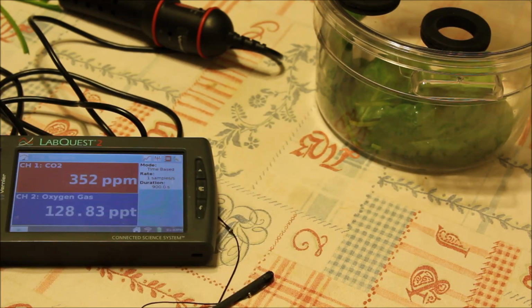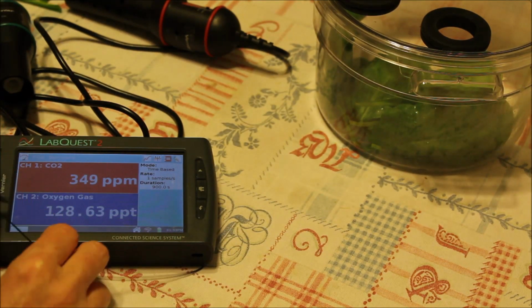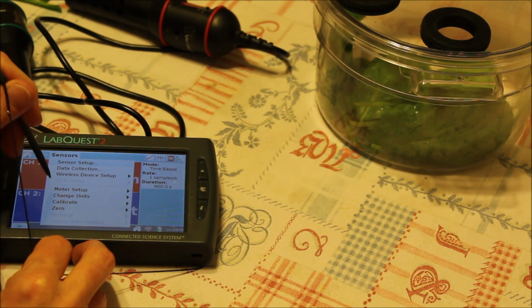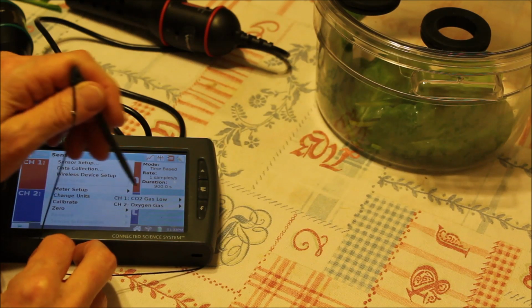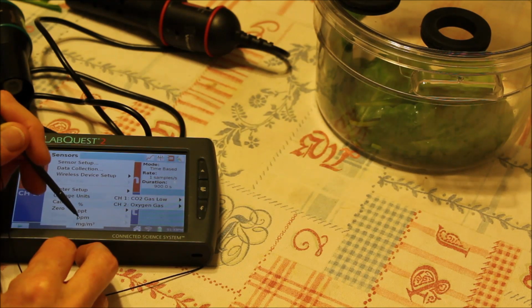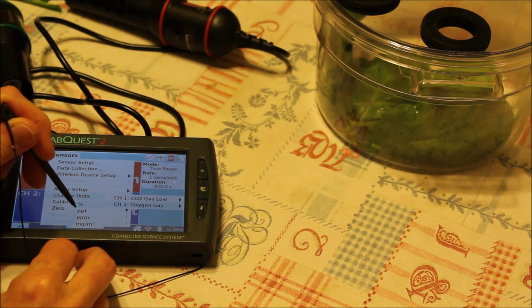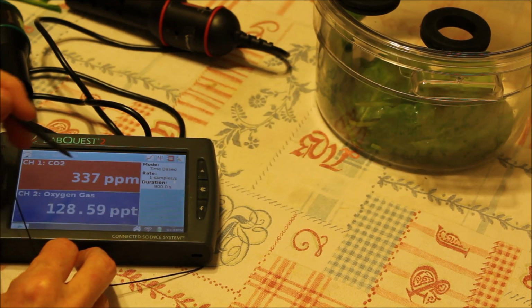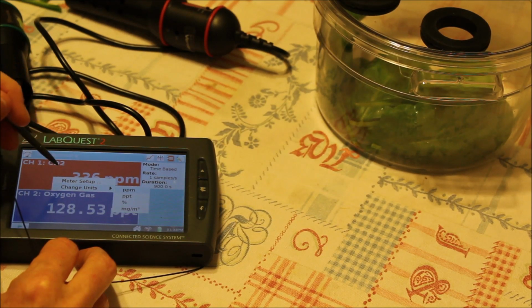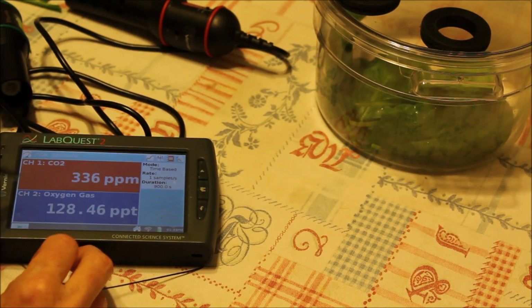It calibrates pretty good on its own. If yours is not parts per thousand, you go to sensors, not calibrate, change the units. You can change the oxygen gas units: parts per thousand, percent, parts per million, milligram per cubic meter. So you just press parts per thousand for the oxygen, and for the carbon dioxide, change the units. You will go parts per million. So that's what you have.